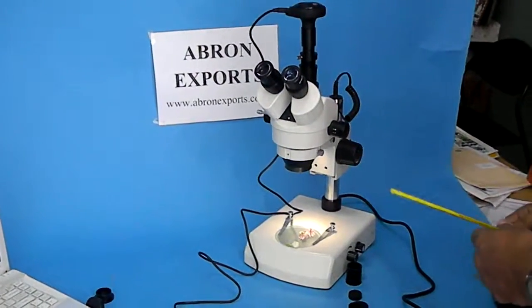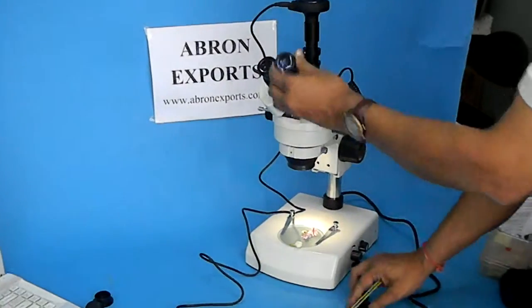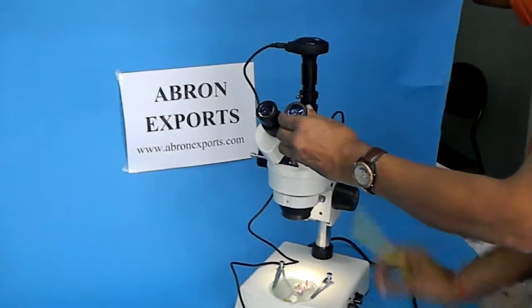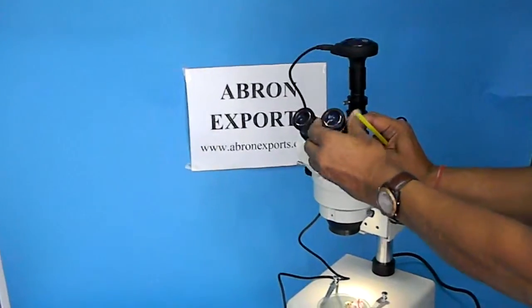Stereo Microscope. Let us learn the parts of the stereo microscope. There are two eyepieces. This is the cap. You remove the cap and then put both the eyepieces in both the sockets.